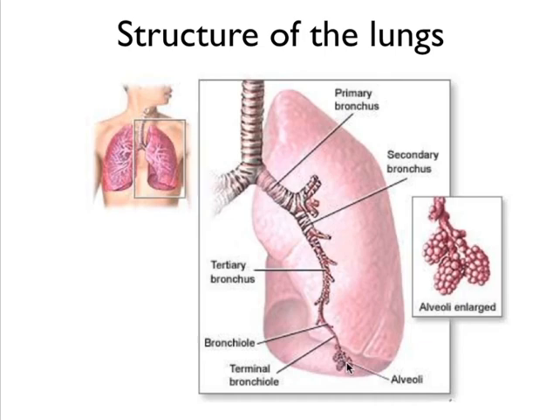And the alveoli are where gas exchange takes place, so where oxygen is taken up in the blood and carbon dioxide is released into the air. What you can also see is that the bronchi, so the bigger airways, are surrounded with cartilage, and this cartilage is needed to give these big tubes support, because if you don't have cartilage there, the tubes will collapse and it will be impossible to breathe. The bronchi that don't have any cartilage anymore we call bronchioles.